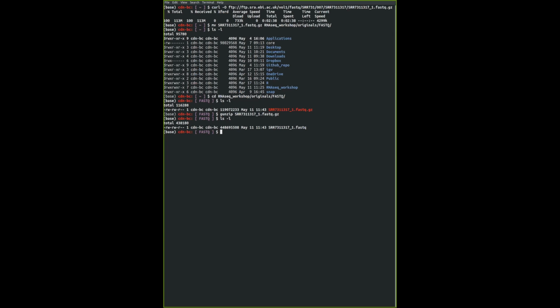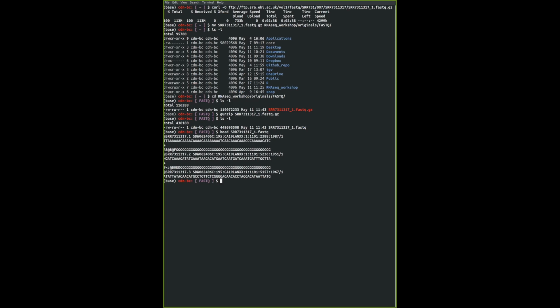Okay, if you remember, we can use the preview function called head. So if you do head of this file, we can actually print out the first 10 lines of the FASTQ file. And then we can also select the first 4 lines, and you can do this with me, because the 4 lines are enough to go through what we need in the next section.